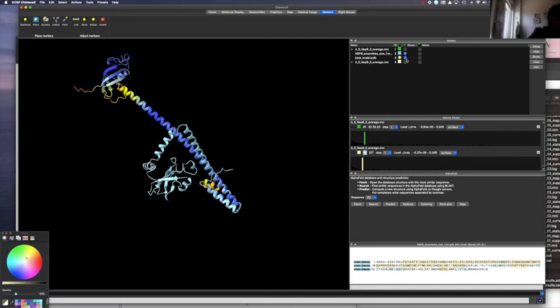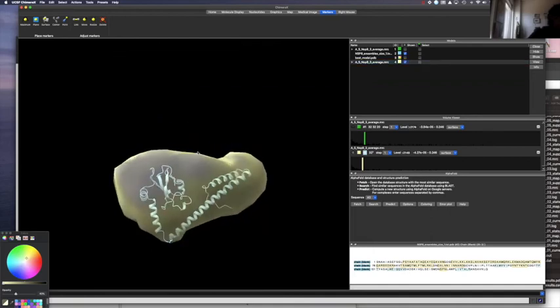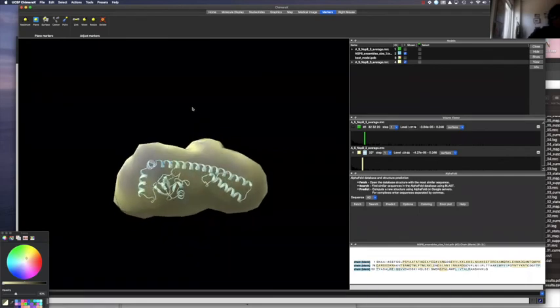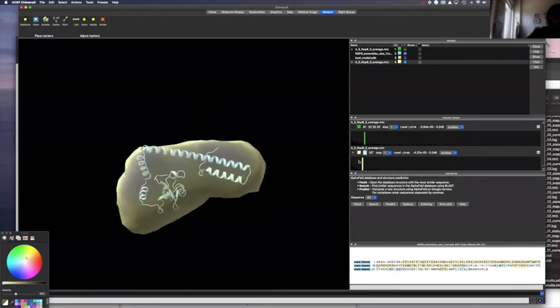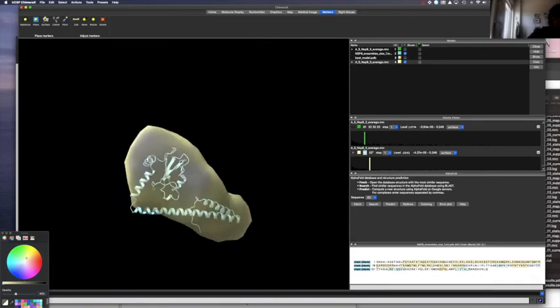And not only the SAXS data, but I know obviously you are keen to see something in 3D. This is a very fast 5 runs of DAMMIF, and it's definitely improved if you do it in slow mode and do at least 10 models, then you can get a better agreement with this folded back NSP8 structure.